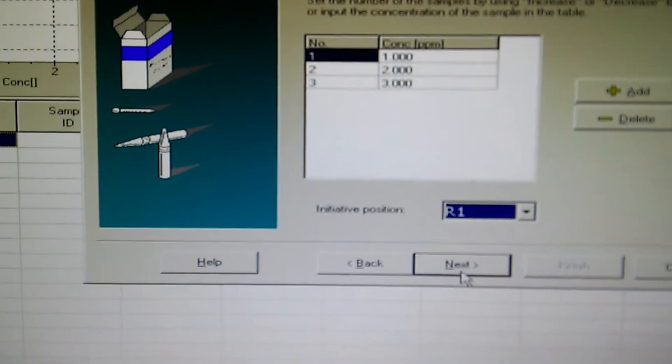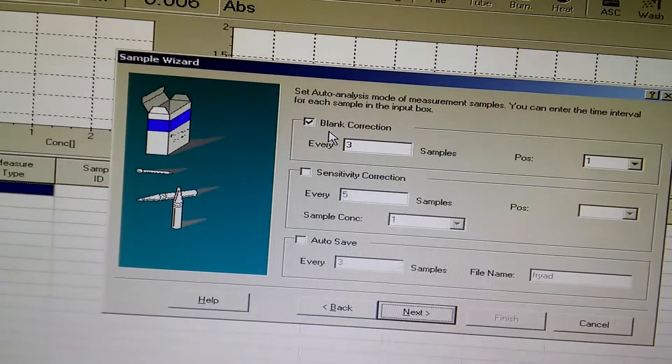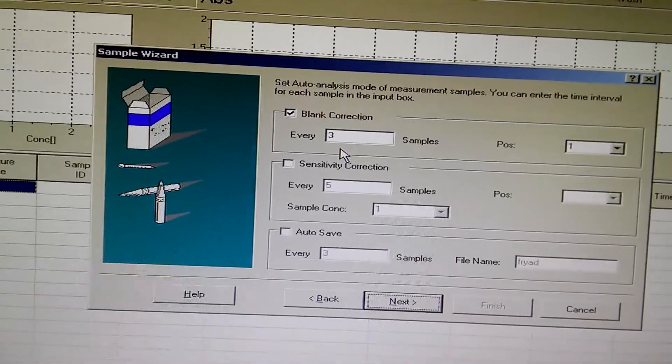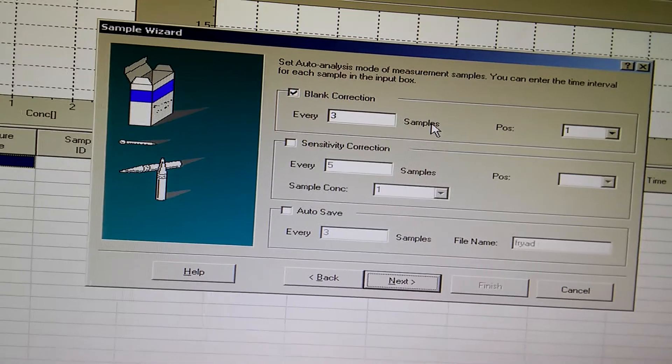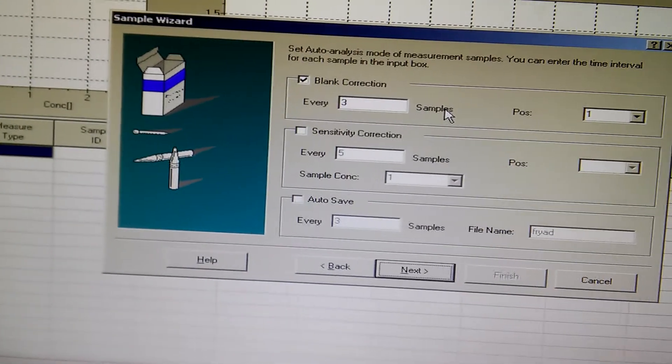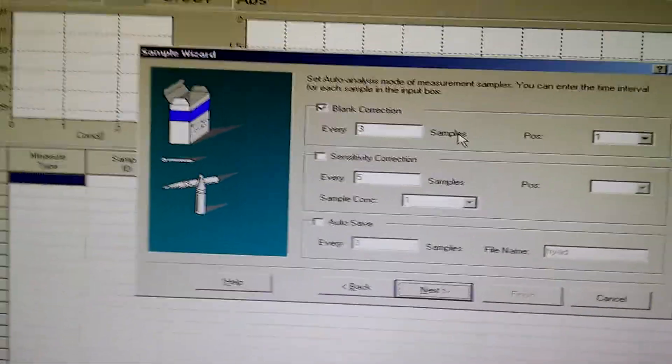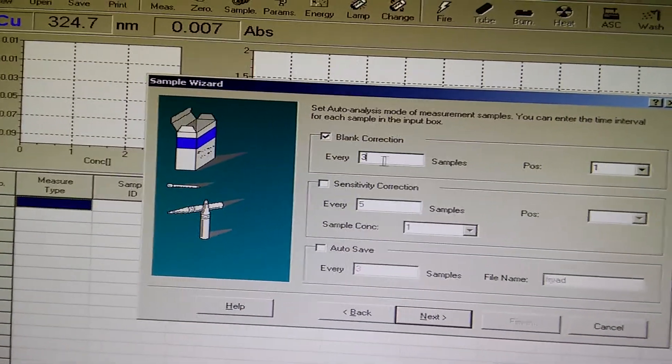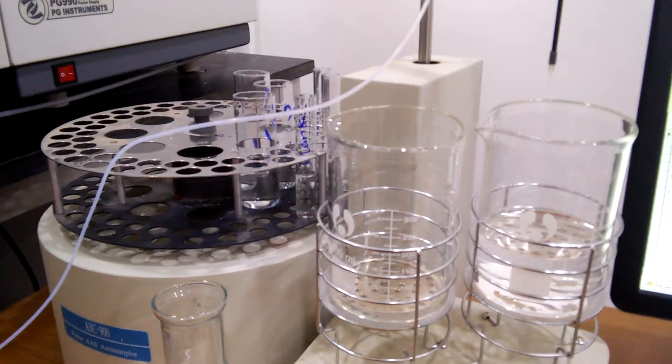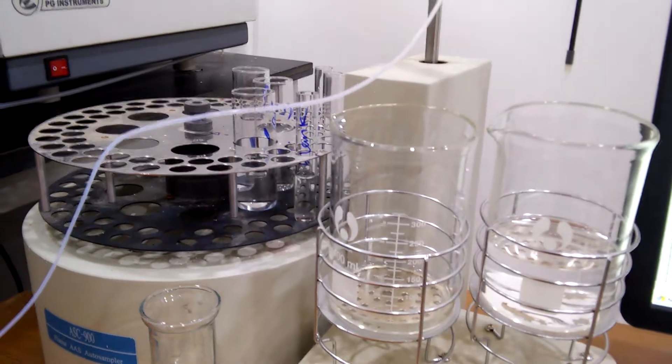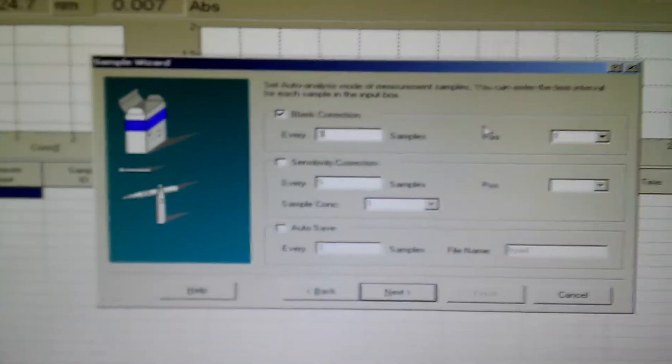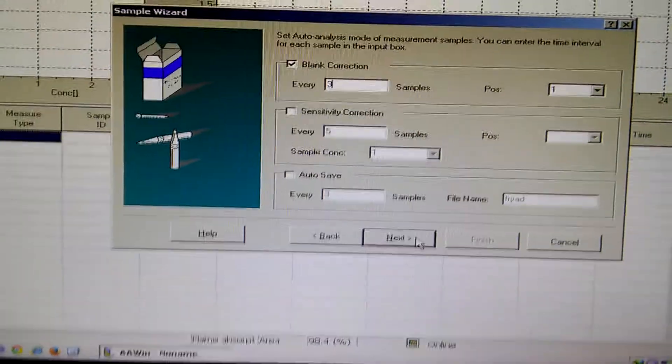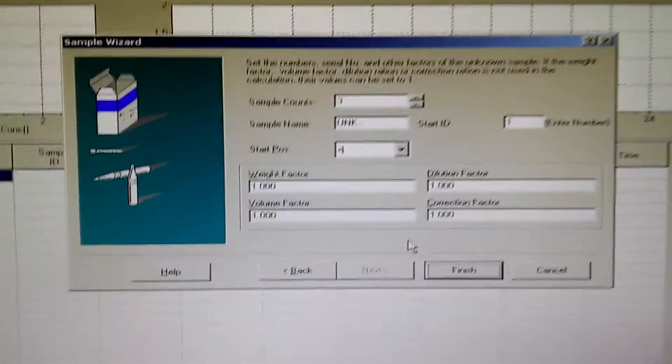Now press next. How many blank corrections? After how many times of determination do I have to clean and make blank correction? I set it here for three times. So when the auto sampler picks up three different samples, it has to make a blank correction after that. Press next. Now we have here blank started with number one, so it will be like this: Unk1, Unk2, and so on.